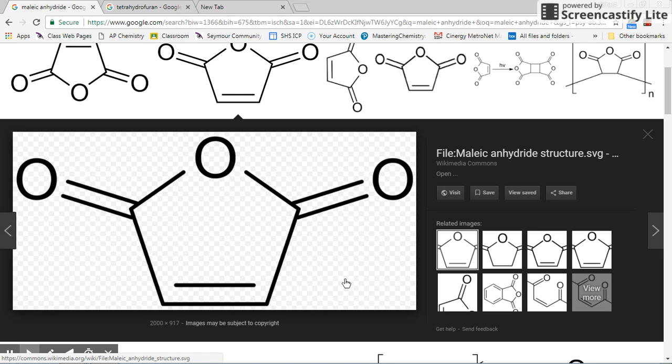So our job tonight is then to determine what carboxylic acid we made. We're going to be able to get the melting point. There's a list of carboxylic acids in the back of the book, and you'll be able to get a close melting point range.